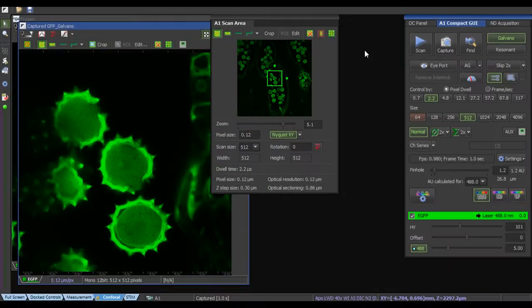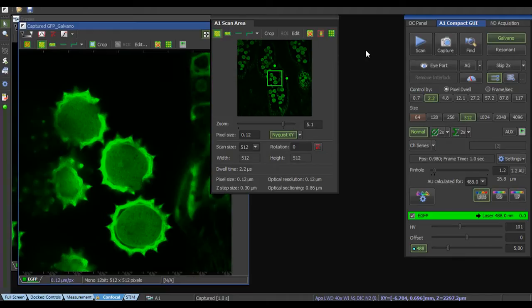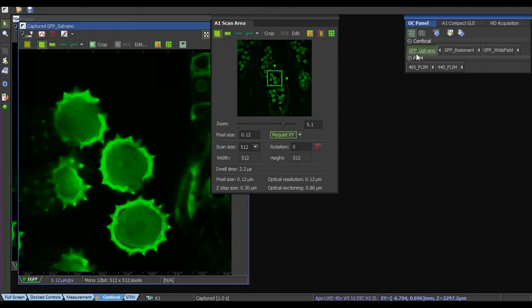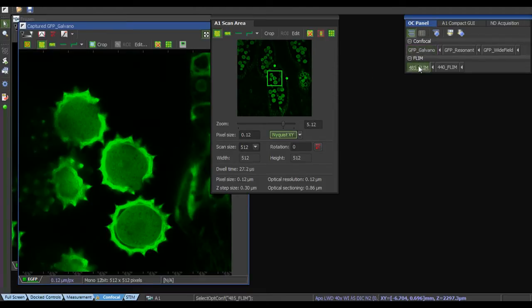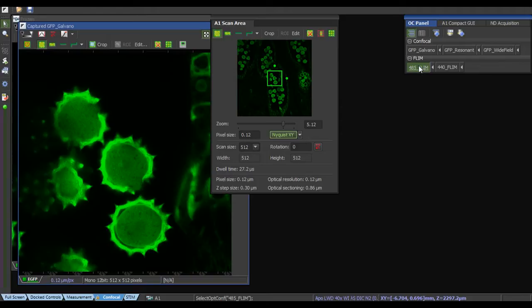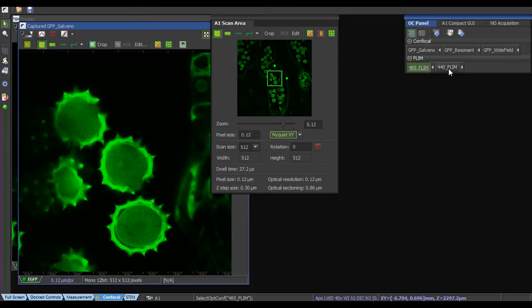So the next step is to change the FLIM configuration. The NIST software from Nikon gives you the possibility to pre-configure different settings. This you can choose for confocal imaging or you can use for FLIM imaging. Here we've got two FLIM setups, one for 485 and another one for 440.